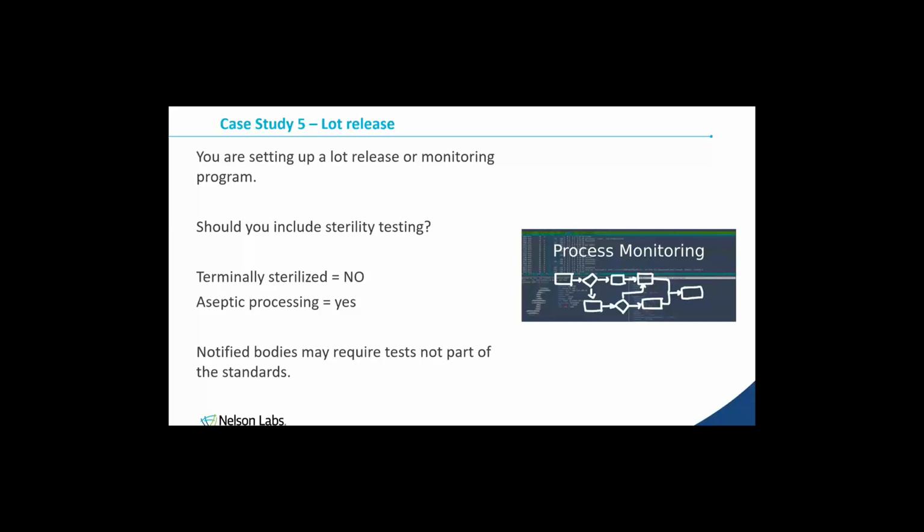The reality is, if a notifying body wants it, sometimes it's just going to be faster to do a 14-day sterility test than it is to try and escalate that and work it through the auditing bodies on whether it's appropriate or not, what testing we should do. But there's always that caveat when it comes to doing this testing, and a consideration of why you should potentially push back is, as we showed with that previous testing, test 30 samples, had absolutely no defects, still had a sterility positive. So what if I'm appeasing a notifying body, I'm taking sterile product, and I'm testing it to demonstrate sterility?